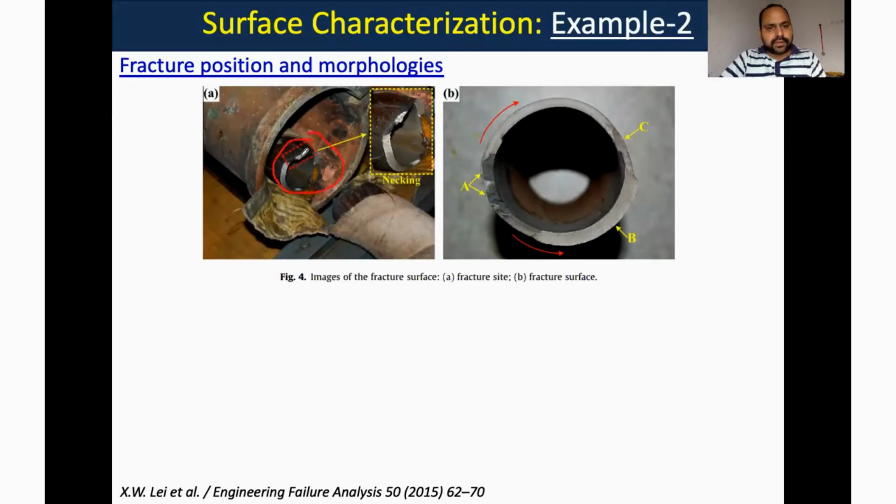So here you can see this area looks like the fracture site. They have just dotted the area inside, and they have zoomed it also. This is the dotted area, and this is the fracture surface.